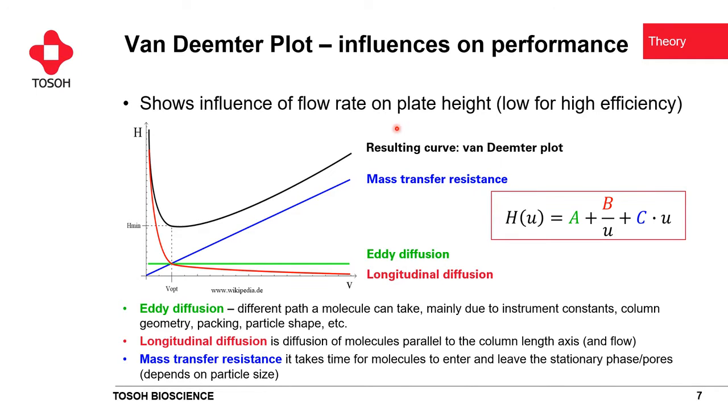Let's start with something you may already know from your studies, lectures, which is called the Van Deemter plot.